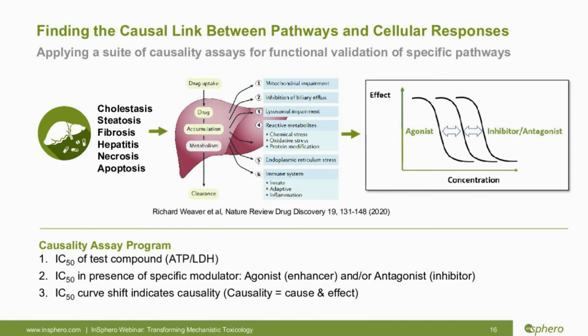It starts with a signal. In this case, what I'm showing today is the signal of cytotoxicity, which has been proven to be involved in predicting liver DILI when you're approaching that in a statistical way. And this signal can be modified by modulators, so by agonists and antagonists. This is what you know from classical pharmacology: a signal, in terms of its validation, where it's coming from, and whether it's relevant or not relevant, has to be challenged by this agonist and antagonist axis.